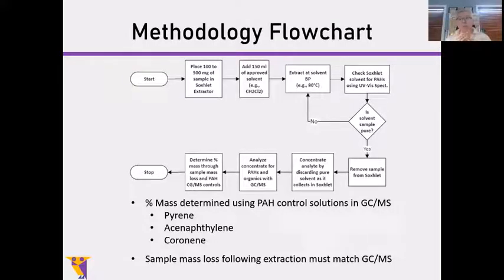You remove your sample. You can concentrate that collected solution, which is drained into the reservoir. You can leave it alone, depends on however you want, but you have to weigh the analyte before and after to know how much material came off.